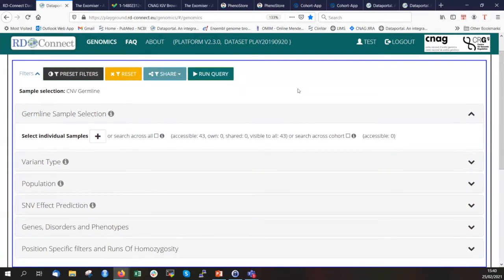Yeah. So if there are no questions, maybe I can do this and show you briefly a case-by-case application. Nancy's asking us if all the BCF data are generated with the same pipeline and the reference genome, and the answer is yes. And then she asks if that means that you would need to update across the board from time to time, and the answer is yes again.